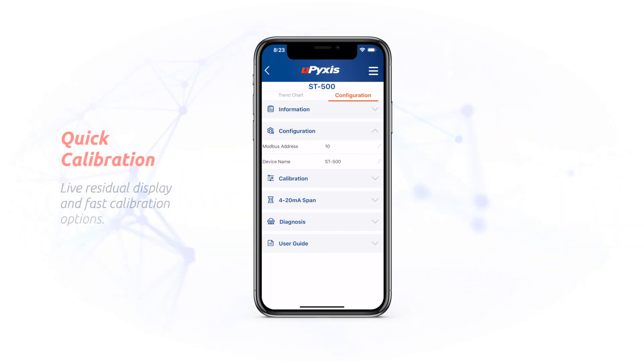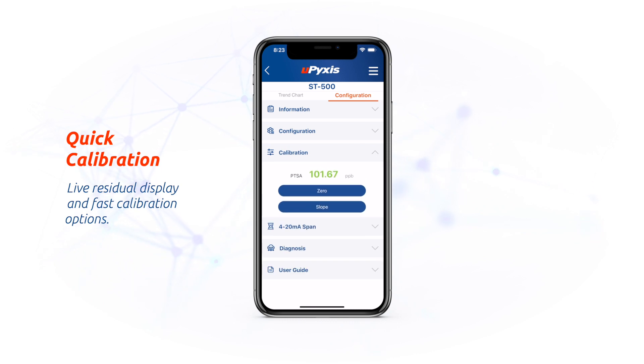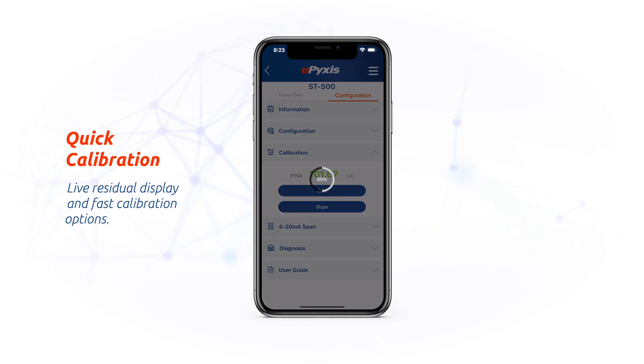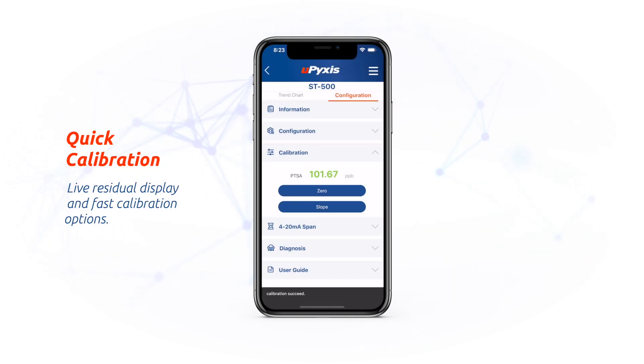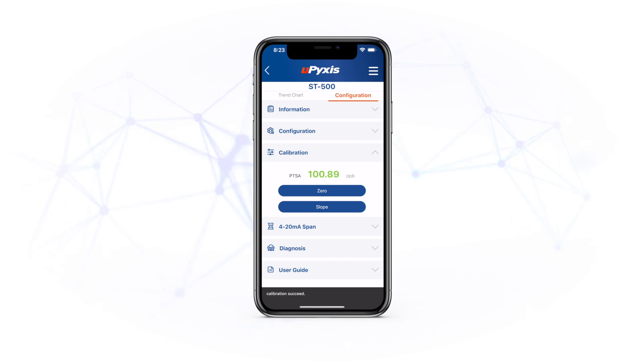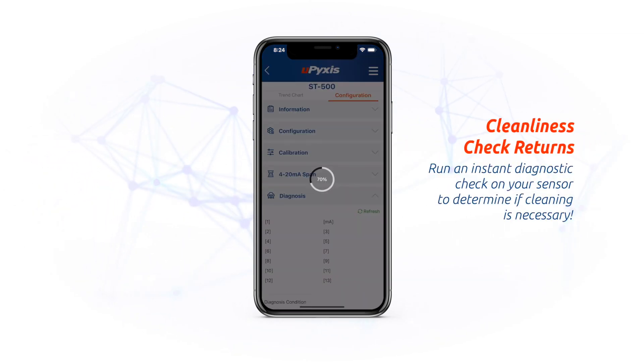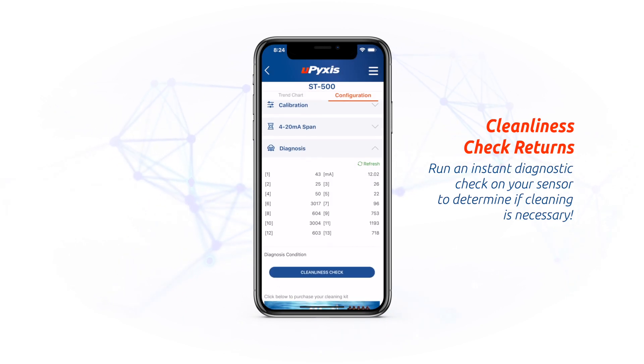Calibration is quick and easy with a live residual display and fast calibration options. Our favorite cleanliness check returns — run an instant diagnostic check on your sensor to determine if it's clean or needs cleaning.